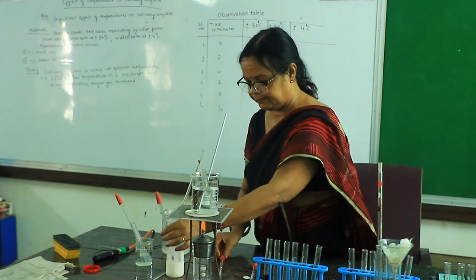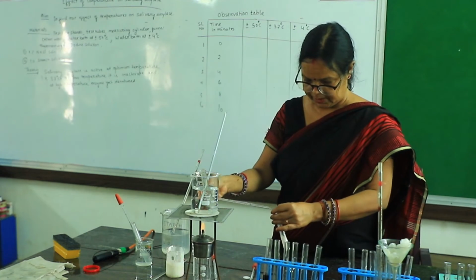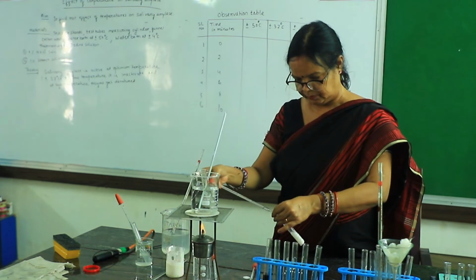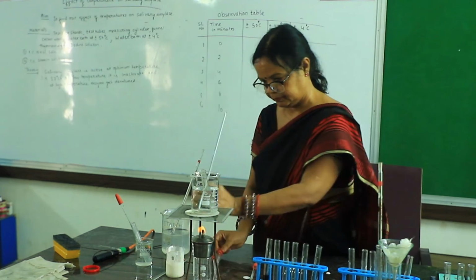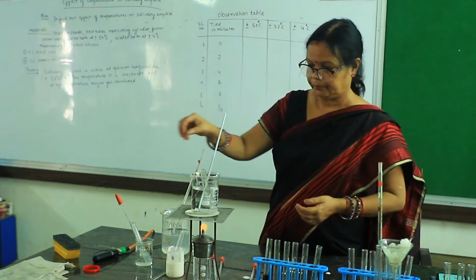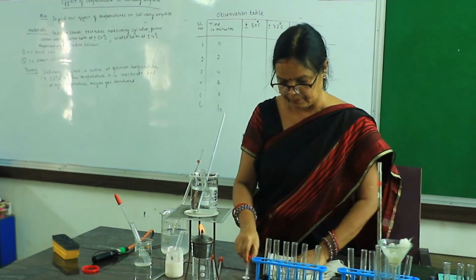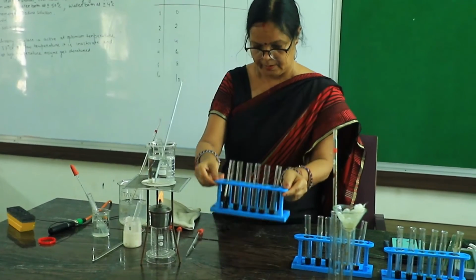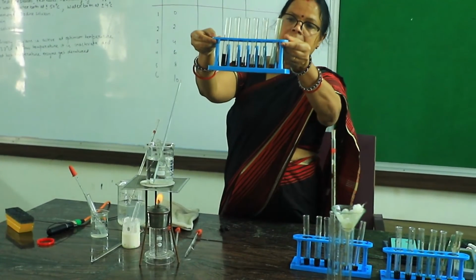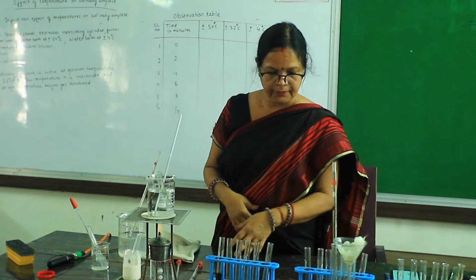From the ice bath, add to the third test tube. So look here, this turned blue black in all three test tubes.